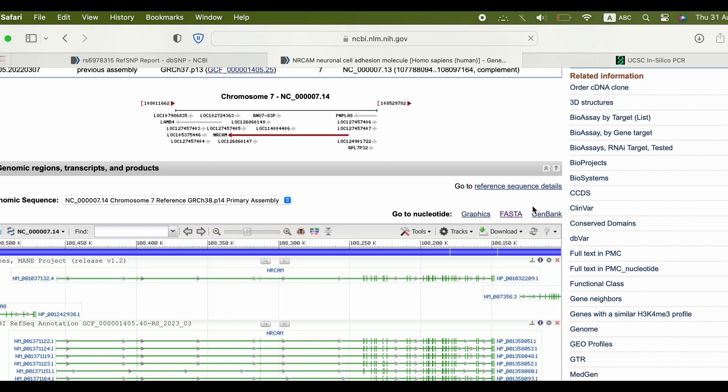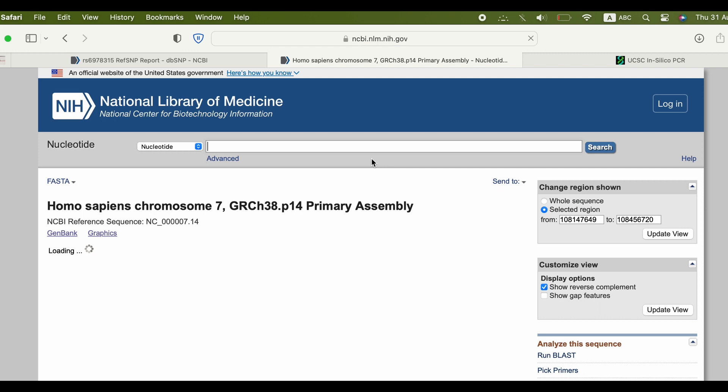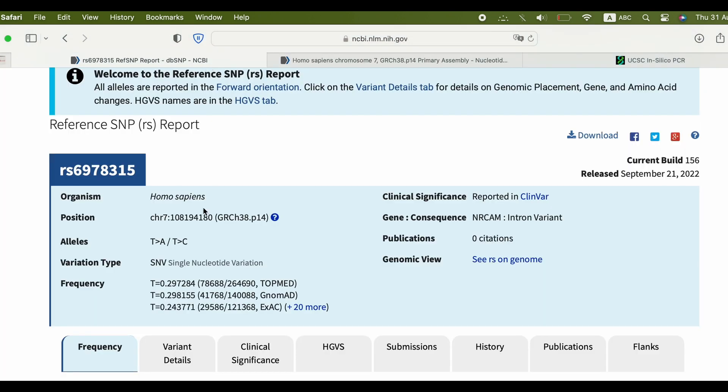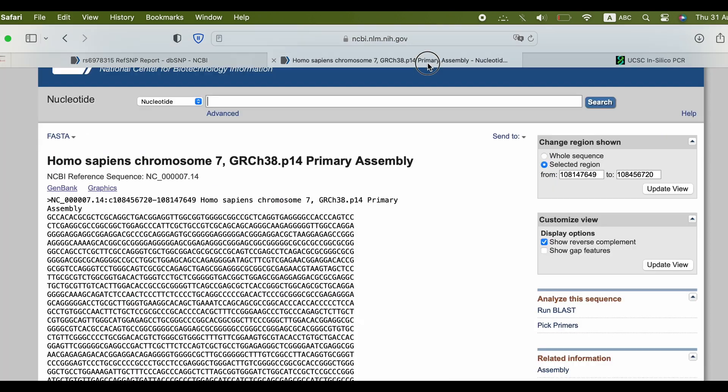You don't need the whole sequence of the gene. So, go back to the first tab you opened and copy the position of the SNP. Now go to the second tab and insert the position of the SNP in the two fields to the right and add 400 base pairs, or as many as you want around the position, as you see.